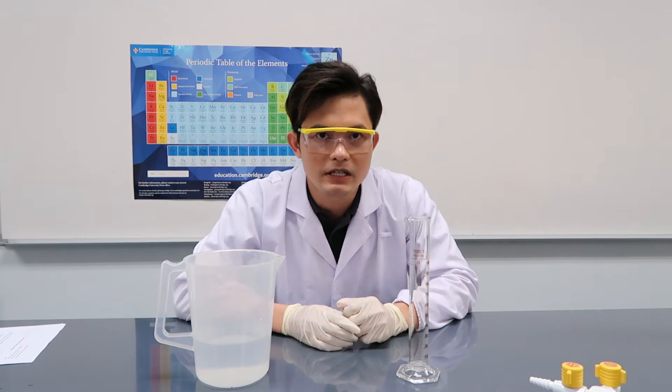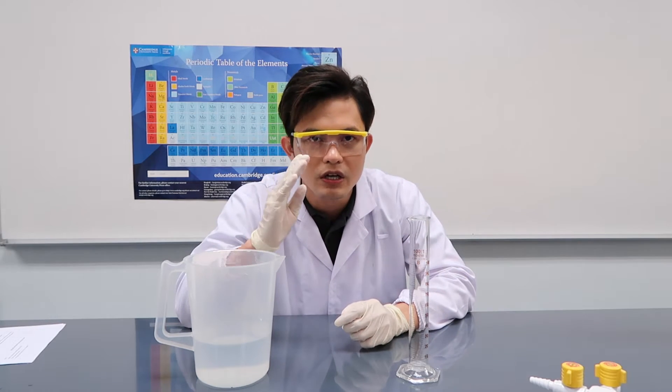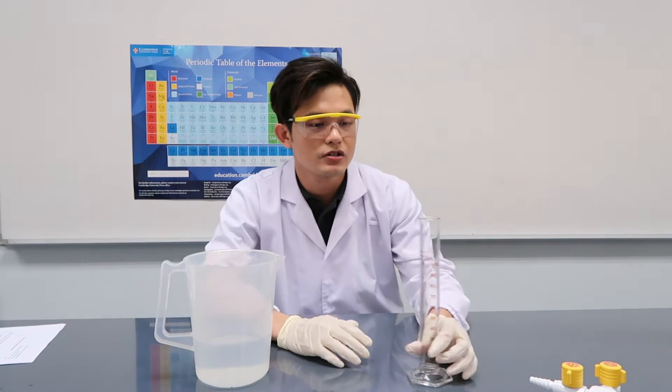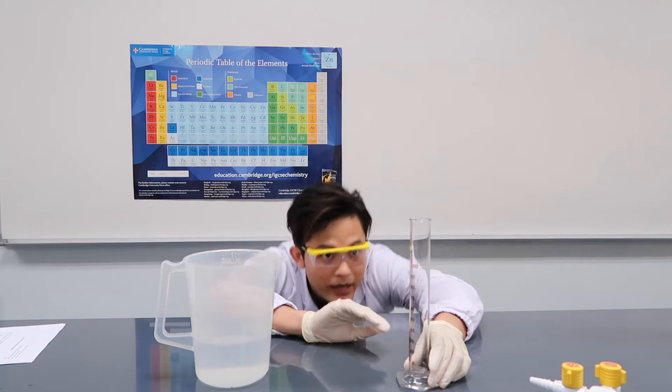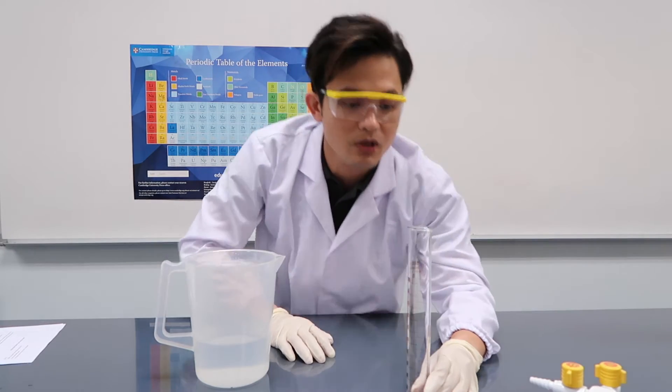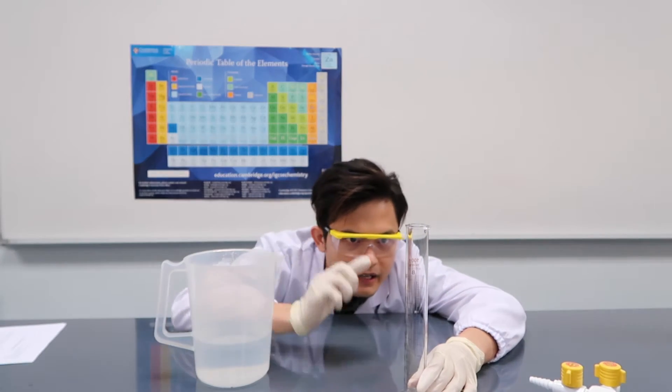In reading the volume of the measuring cylinder, we should always look at eye level. You cannot read the volume like this when it's too high, you cannot read it when it's too low. It's always at eye level.